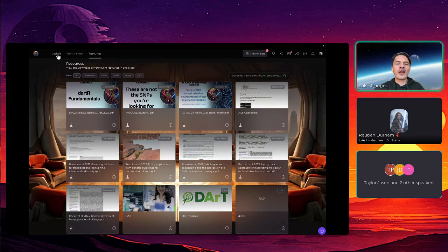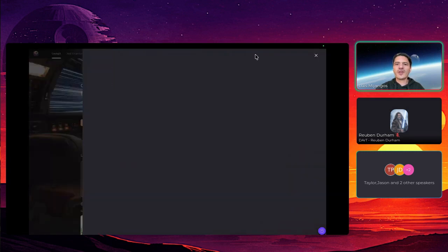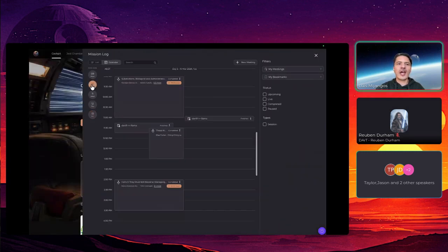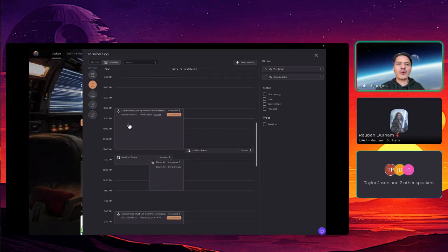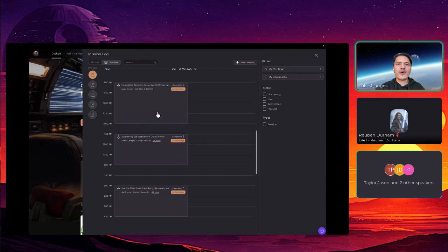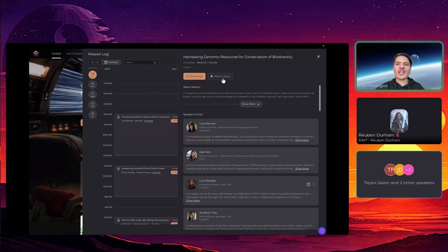And also, if you want to rewatch a session, you go to the mission log, either here or here, and then you go to a specific day. If we want, for example, to go to the very first session, we click here, and you will see watch replay.